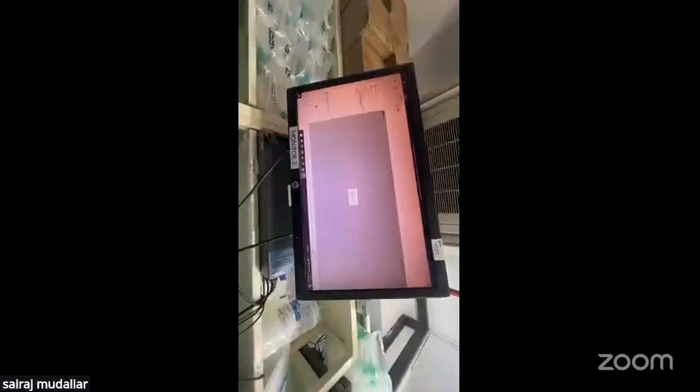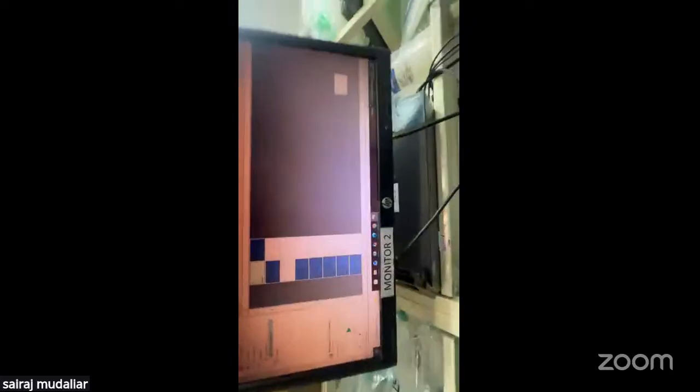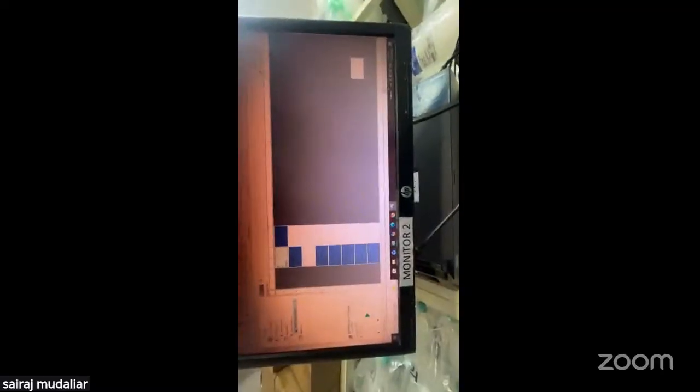So what is the basic logic? Just take out the plate layout. So this is how the plate layout looks. The basic logic is that we measure the absorbance or the intensities at 280, as well as the peptide at 205.